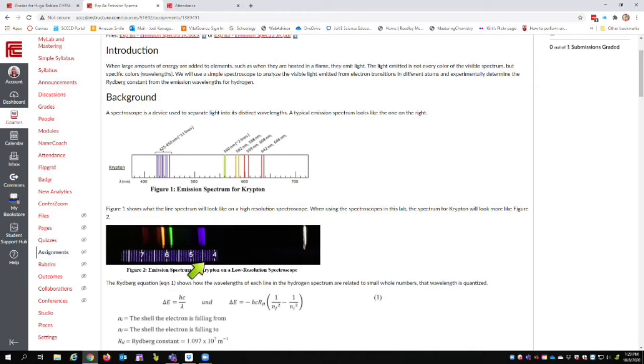This corresponds here to about 450 nanometers, and we see on this scale there's 400 and 500, and 450 nanometers is right here. This, being a very inexpensive piece of equipment, is not going to be very accurate. It's going to be off, and we see that here, that this seems to be centered on the 450, and here it ends at 450.